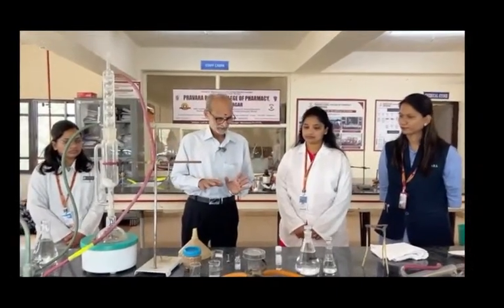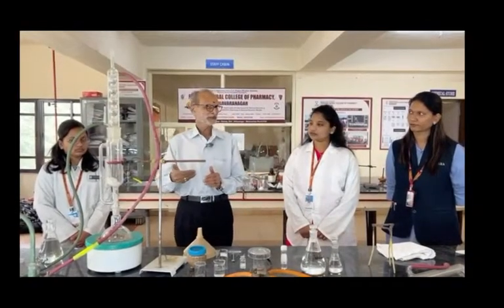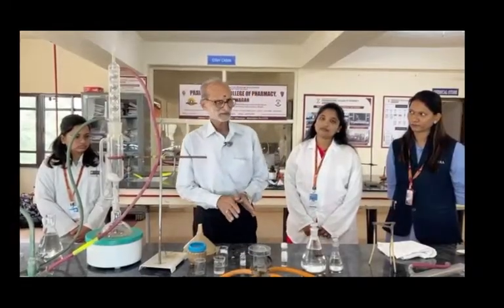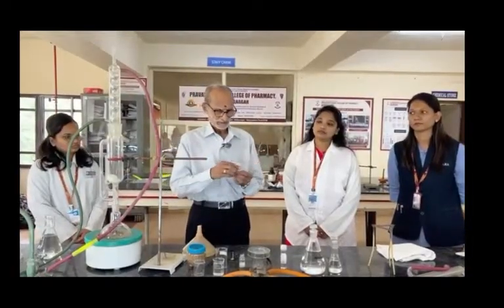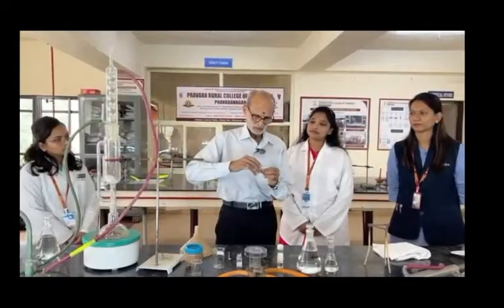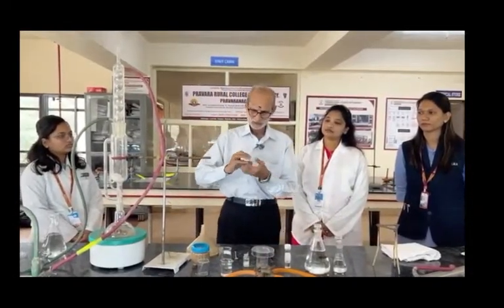So this is the solvent extraction and isolation of embelin from Embelia ribes fruit powder. Before that, we need to ascertain whether embelin is present in the powder or not. Here, the amount of embelin you get is very less, so we are going to make a solution in methanol, because in most powders the embelin content is a very small amount.